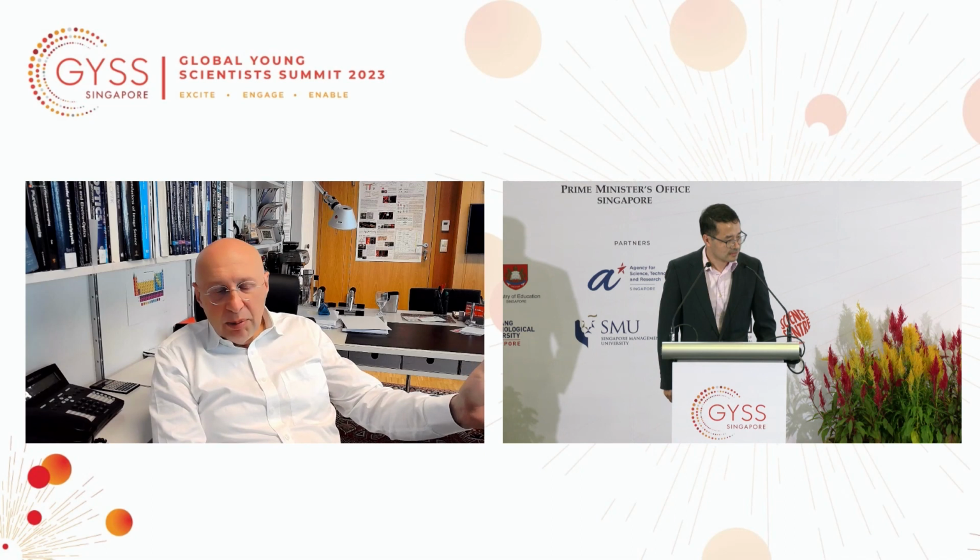Of course, people have tried that. Actually, they tried to squeeze the light down to tiny holes, so-called near-field optics, and this has actually been Eric Betzig's first approach. And I realized that this is completely the wrong way, because the light doesn't want to go through tiny holes, because the light wants to be diffracted. So let it be diffracted, and then use different ways of separating molecules, not just through the focusing of light. Do not separate by photons, separate by states.